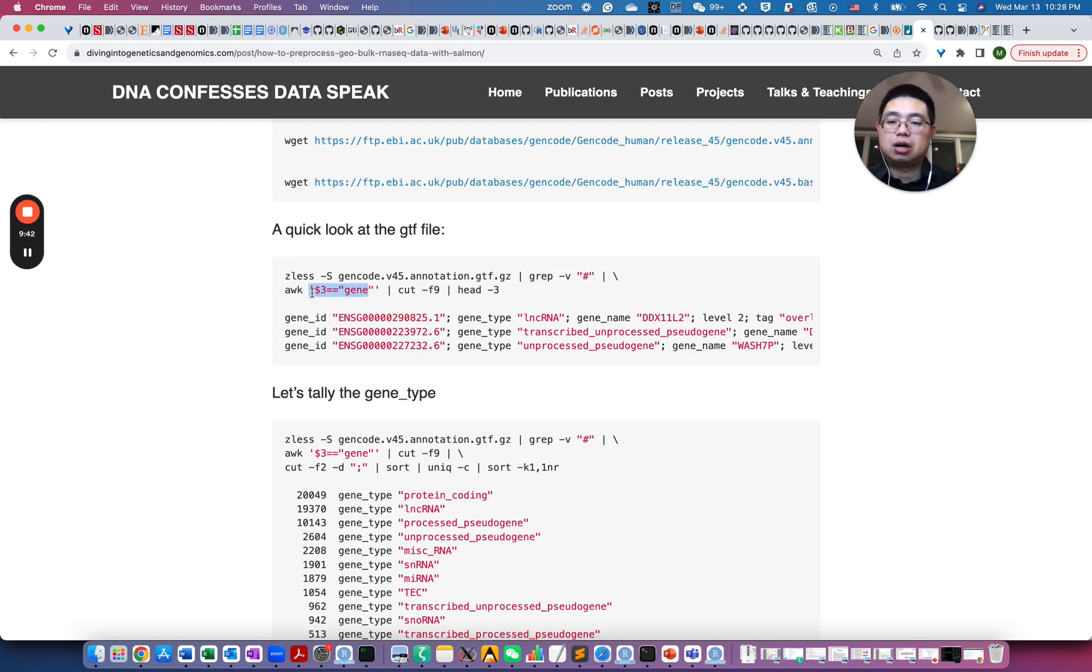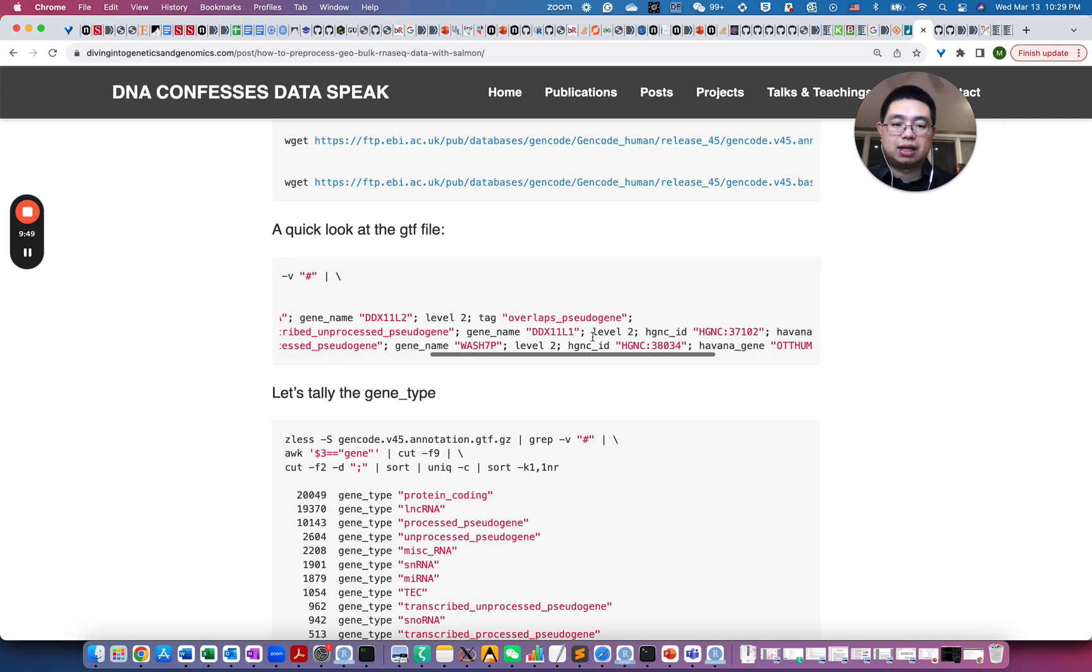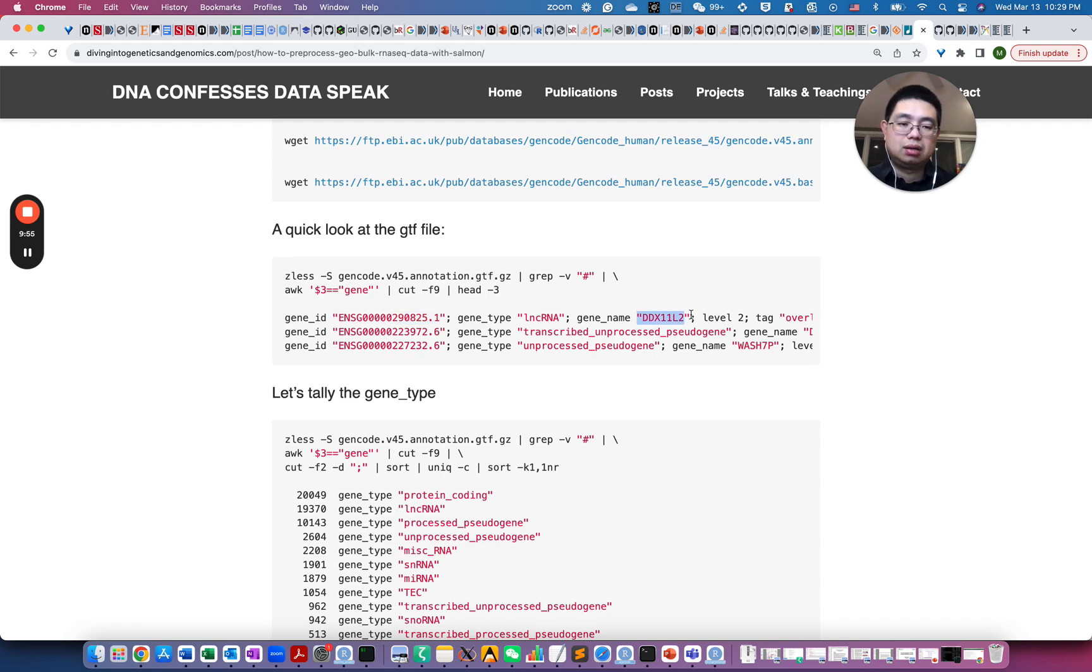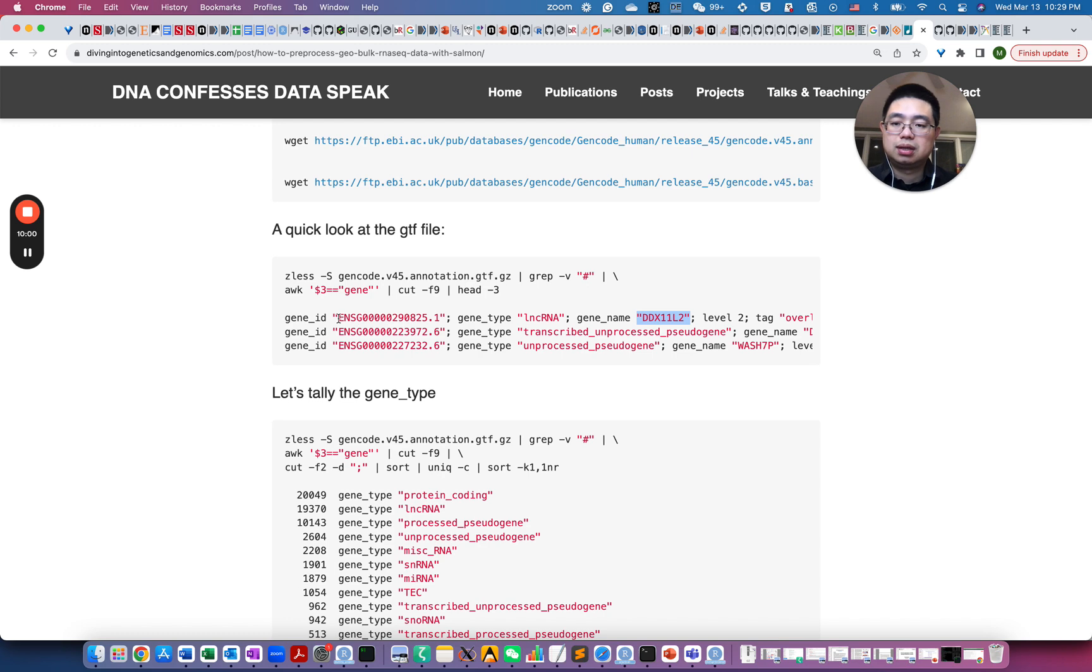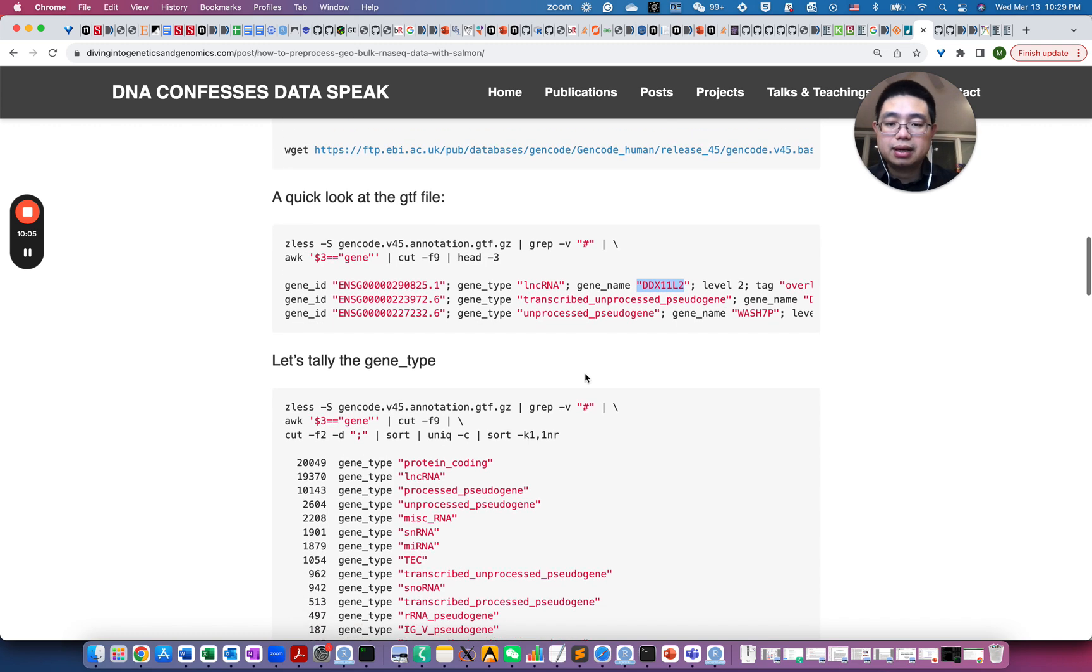The third column is the gene and cut out the ninth field. So it will be the field that contains the information, for example, the gene ID here, Ensembl ID, and also the official gene symbol. So those are the fields that we are going to use to map the Ensembl ID and the gene name.